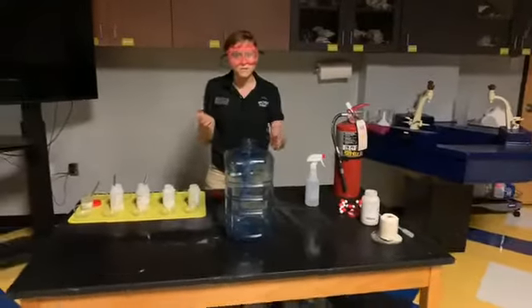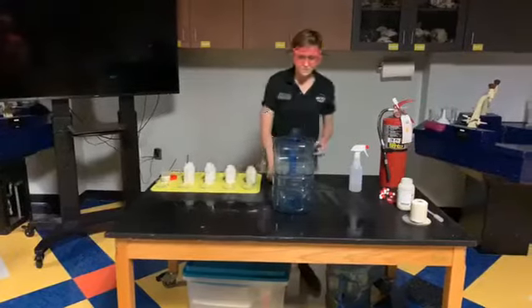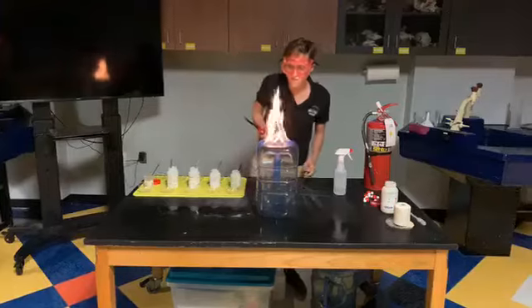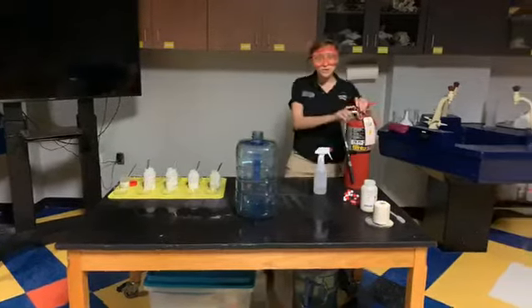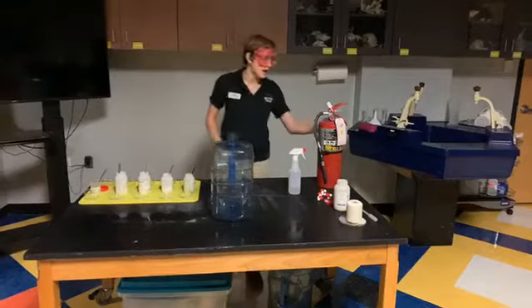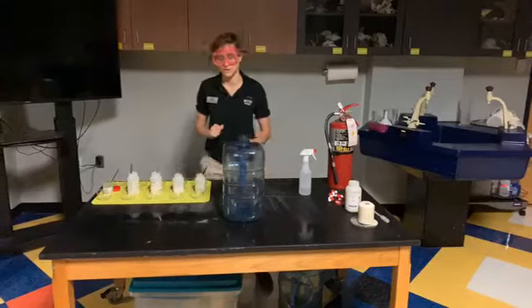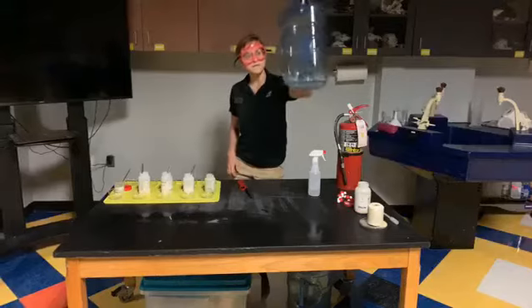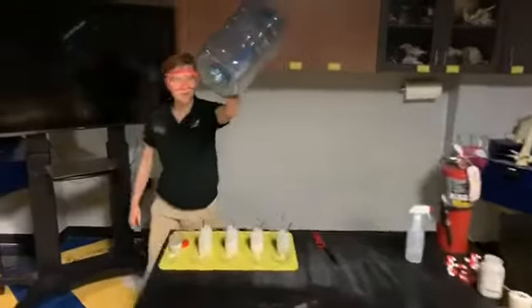And again, our fire went out. What do you think happened this time? Did we run out of the fuel again? One of the ingredients must be done. Still have my spark. Ooh, a little bit more fire than I expected. And that's why when I do this reaction, I make sure that I have all the proper safety equipment. I have my safety goggles, I have my fire extinguisher here, and of course I'm doing it on these flame-proof tables.